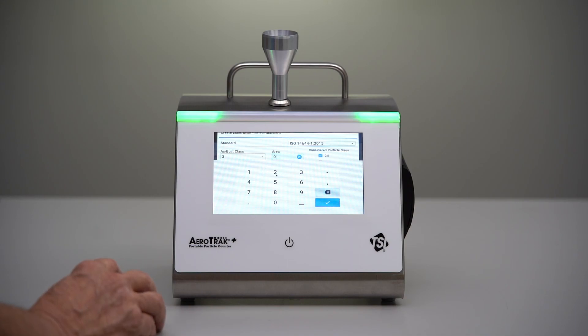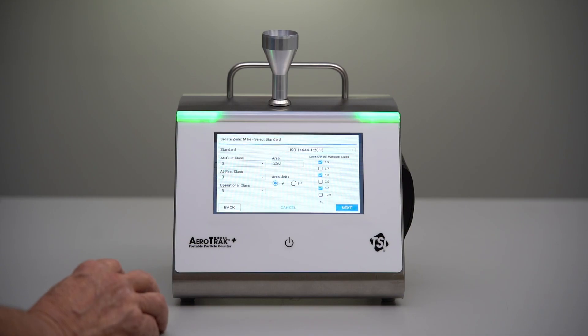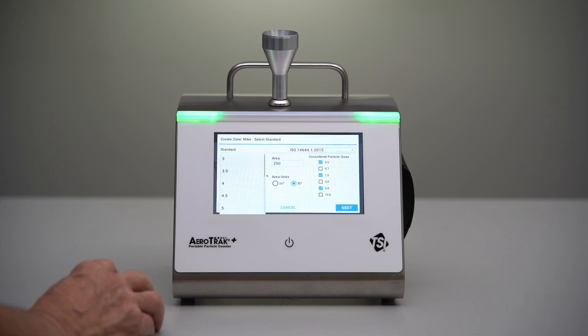We just have to input our area — we can input in either feet or meters — and the program will automatically convert it to the correct number of sample locations. Then we just have to select the classes that we'd like to certify to.